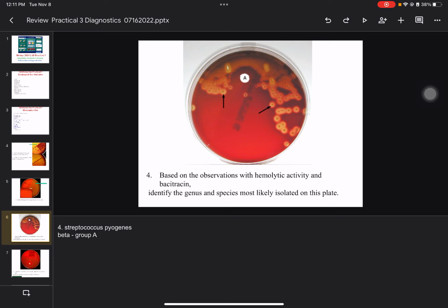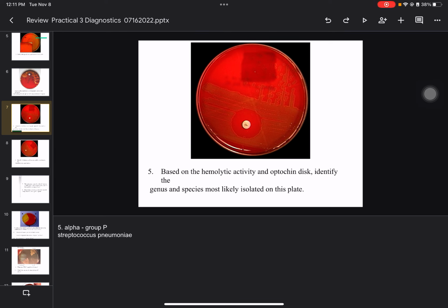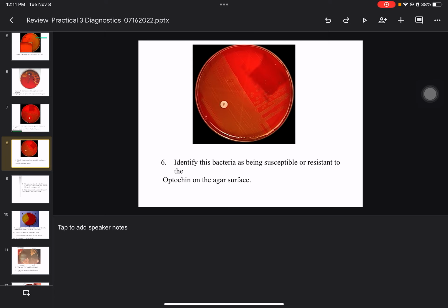That's true. All right. So is it pneumonia? Streptococcus pneumoniae. So here, is it okay if we just write S. pneumoniae? Anything that follows the rules of binomial nomenclature is fair. Is this underlined? But if you say Staph pneumoniae, that's gonna be wrong. Did we have any other examples with this blood agar, with the sensitivity to the optochin and the bacitracin, besides S. pyogenes and S. pneumoniae? We did not, but we could have easily put group B on here, and group B would have been resistant to everything.